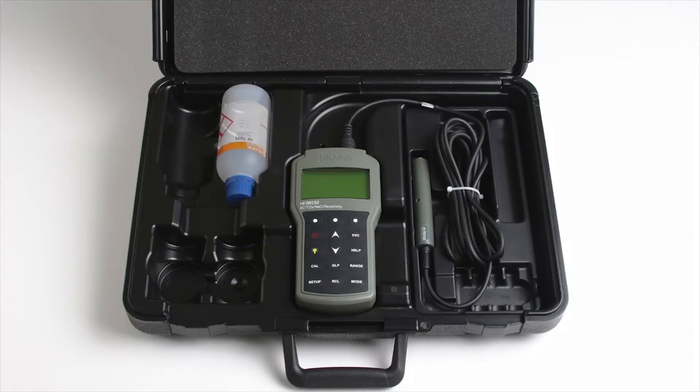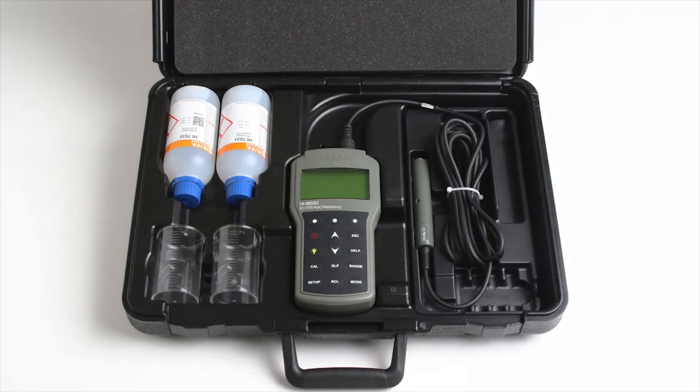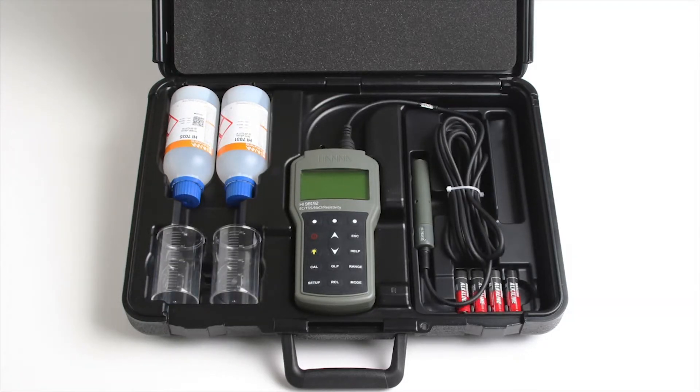One bottle of 1413 microsiemens per centimeter calibration standard, one bottle of 111.8 ms per centimeter calibration standard, two plastic beakers, and four AA batteries.